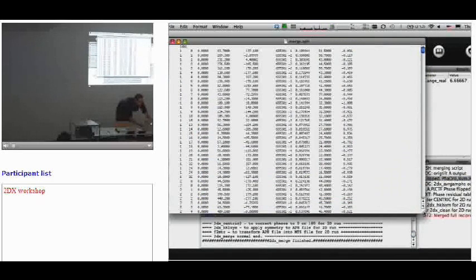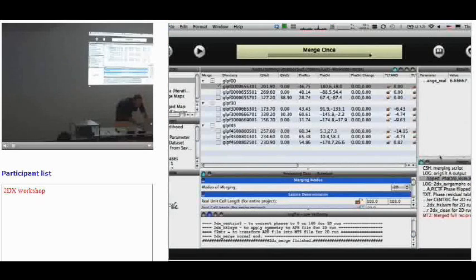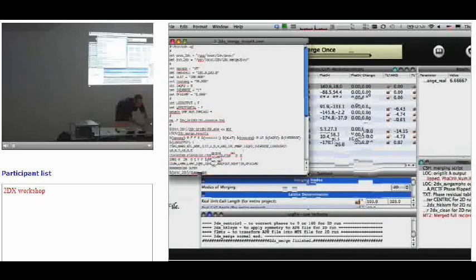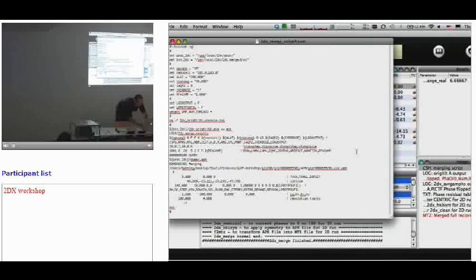And if you want to look what all these columns are, that's on the web page. So merge APH. We use origtilt, and origtilt is a complicated program. There's a lot in it, beam tilt refinement, for example. What we do is we create, with all the parameters that we have, a C shell script here that calls origtilt and then runs it, and the output of the origtilt run of this entire script goes into this other log file, text file here.